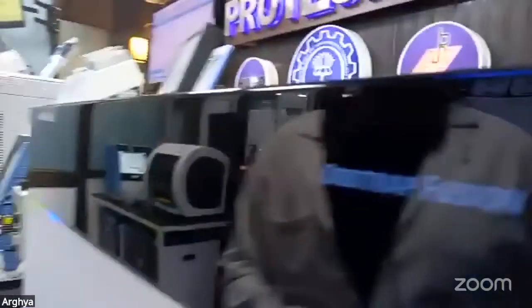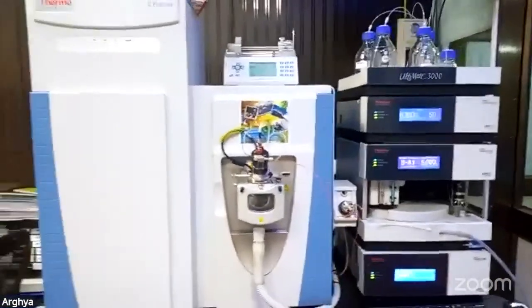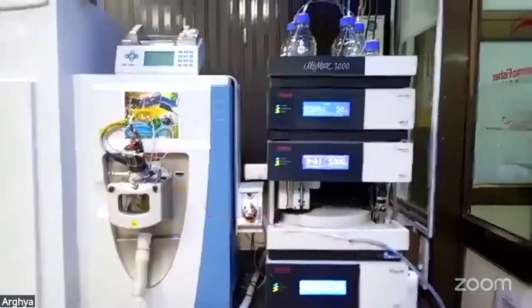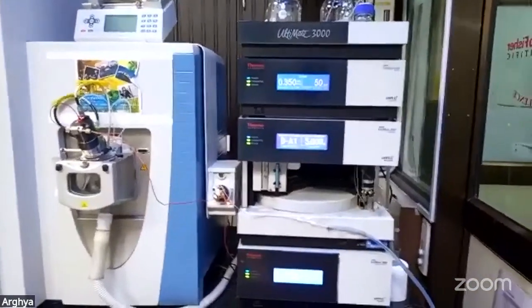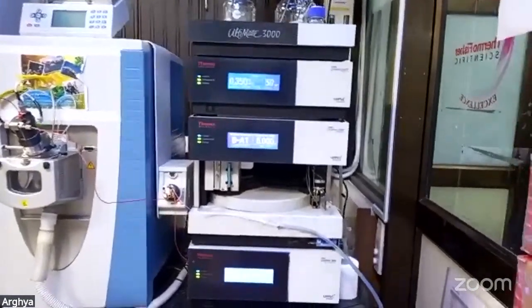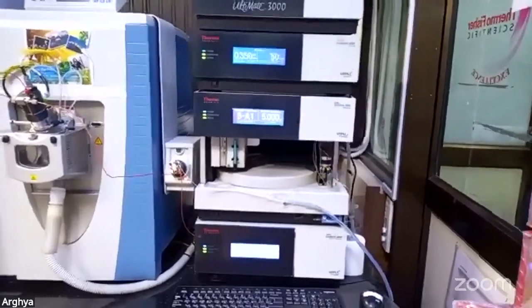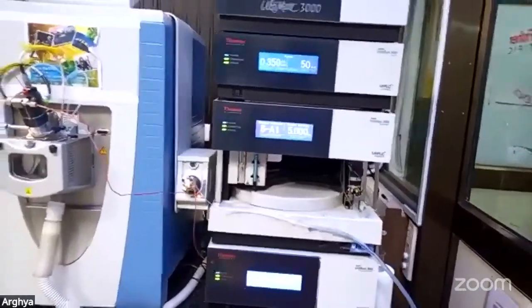Apart from this tribrid mass spectrometer, the Orbitrap Fusion, we have the Q Exactive, which is also an Orbitrap-based technology in which we perform metabolomics and lipidomics sample analysis. This is an Ultimate 3000 series UHPLC, which can work with a binary or quaternary pump and can withstand 900 bars of pressure, a very robust instrument.